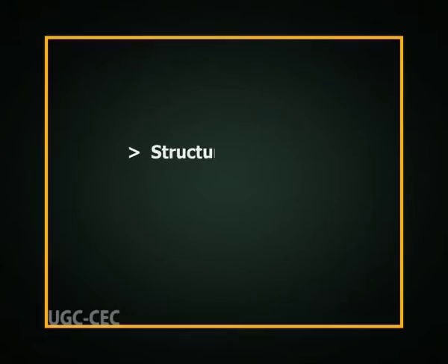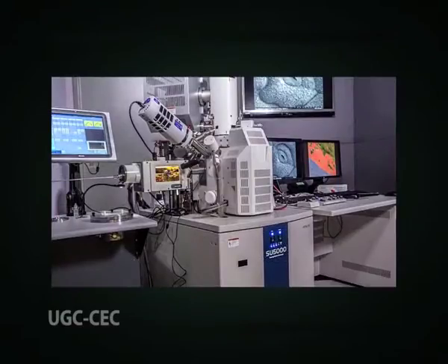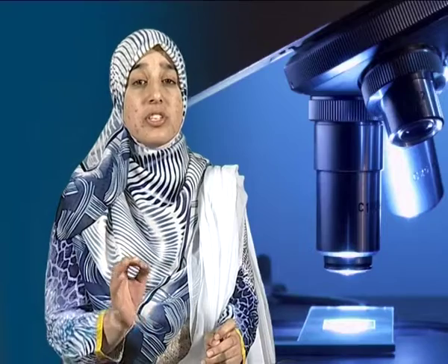This technique provides rapid physical fixation and avoids the risk of introducing artifacts entailed in chemical fixation, structure collapse or shrinkage as sometimes occurs in typical preparation methods. Therefore, the advantages of cryo-SEM include the preservation of the triphasic structure of a sample with the distribution of solid, liquid and gas in a state closer to its natural state. However, its high cost is its main drawback.